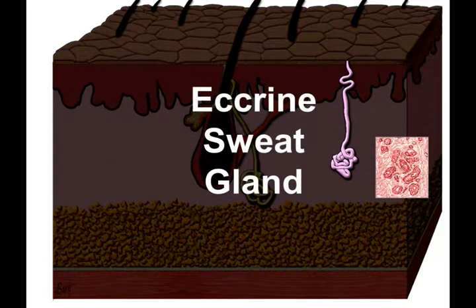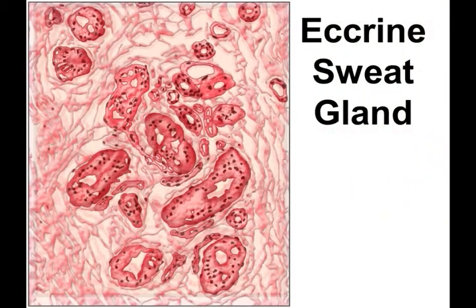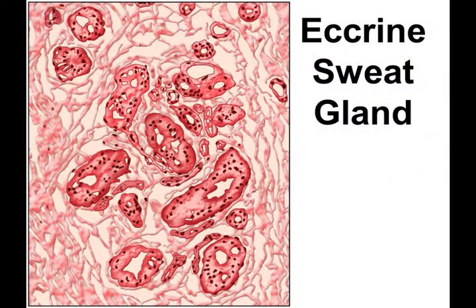The eccrine sweat gland has a lower coil, a straight segment of the duct, and then a curled, coiled intraepidermal acrosyringium. The coil of the secretory unit sits, often surrounded by fatty tissue, within the deep dermis.